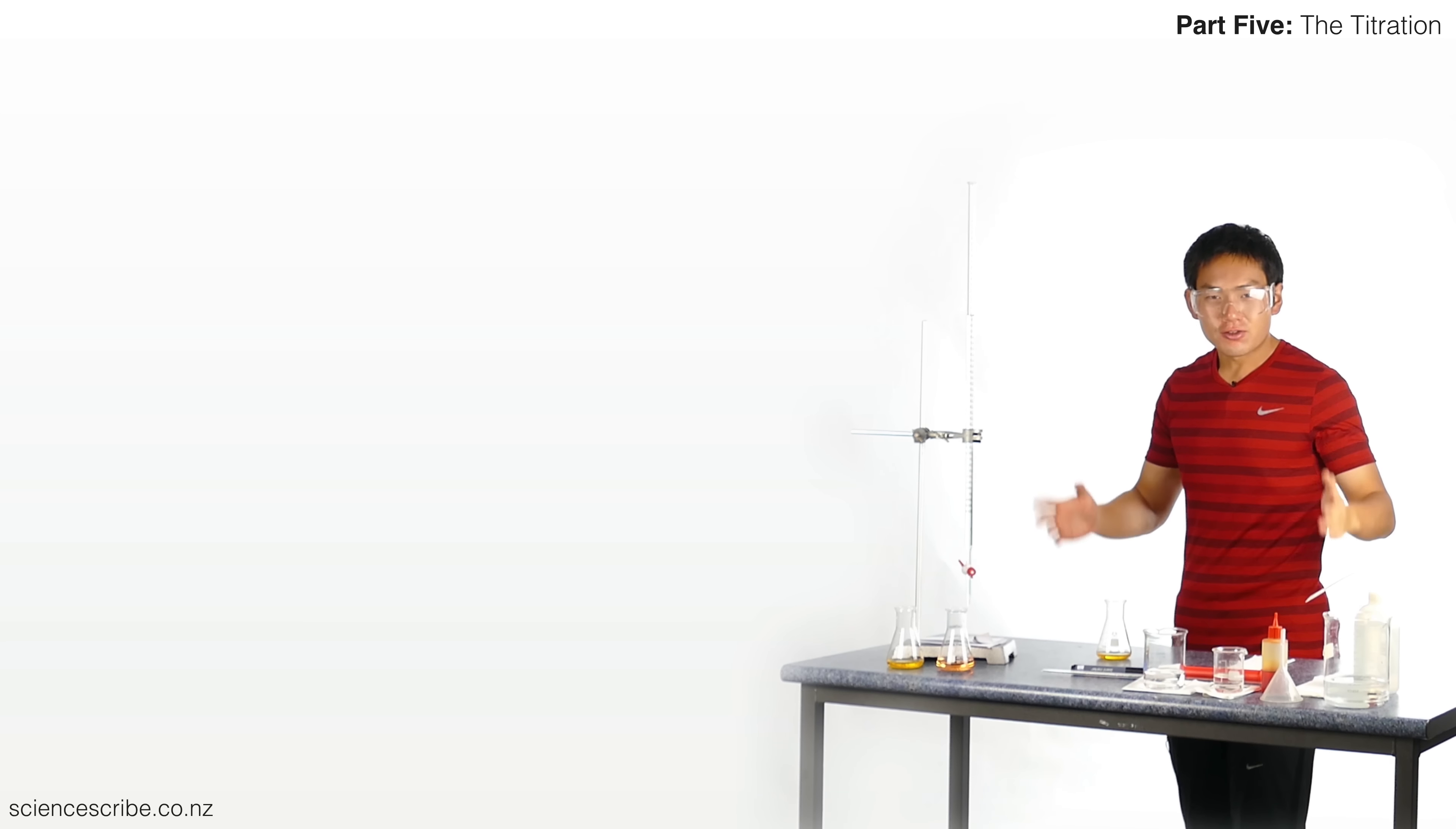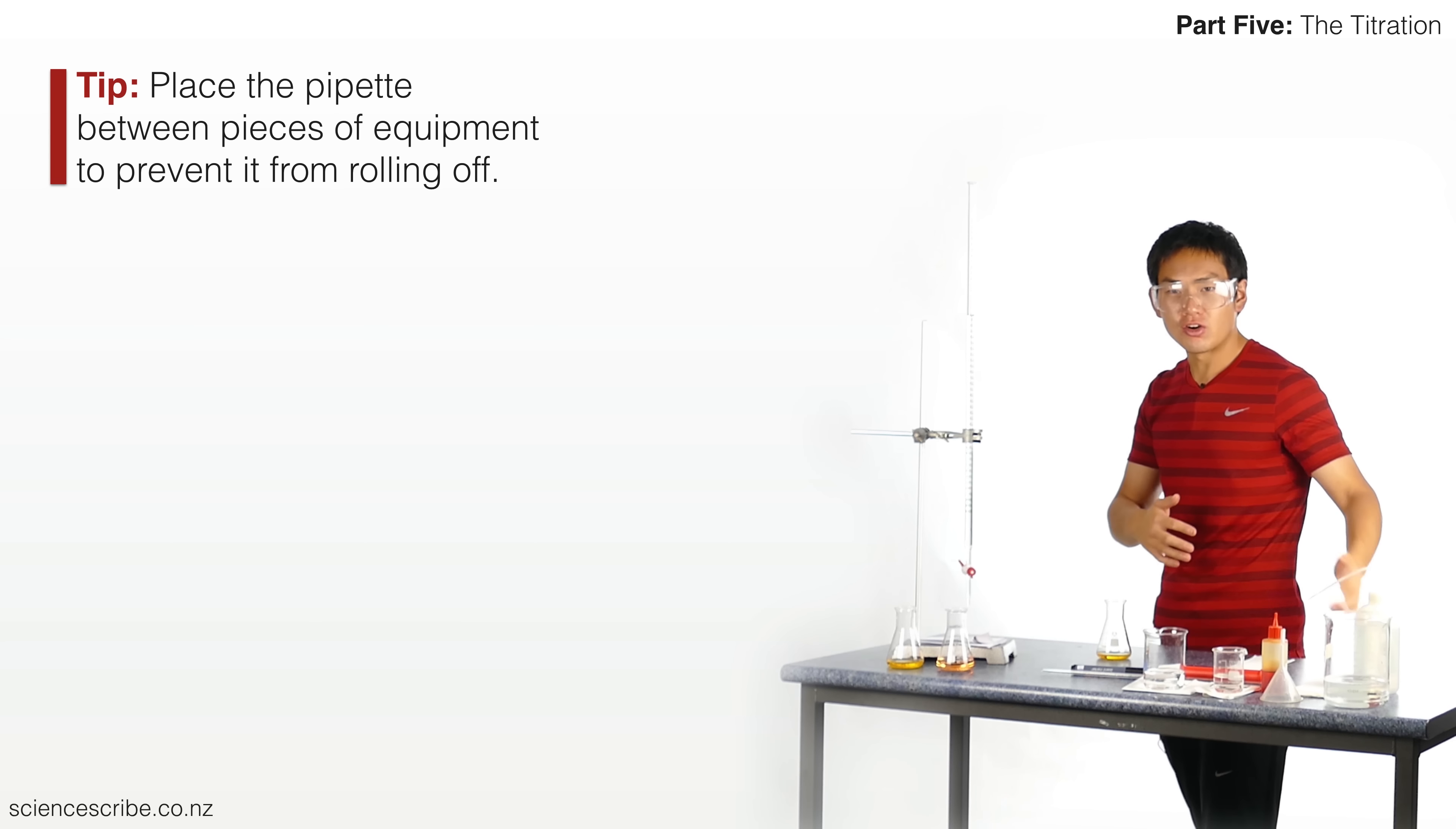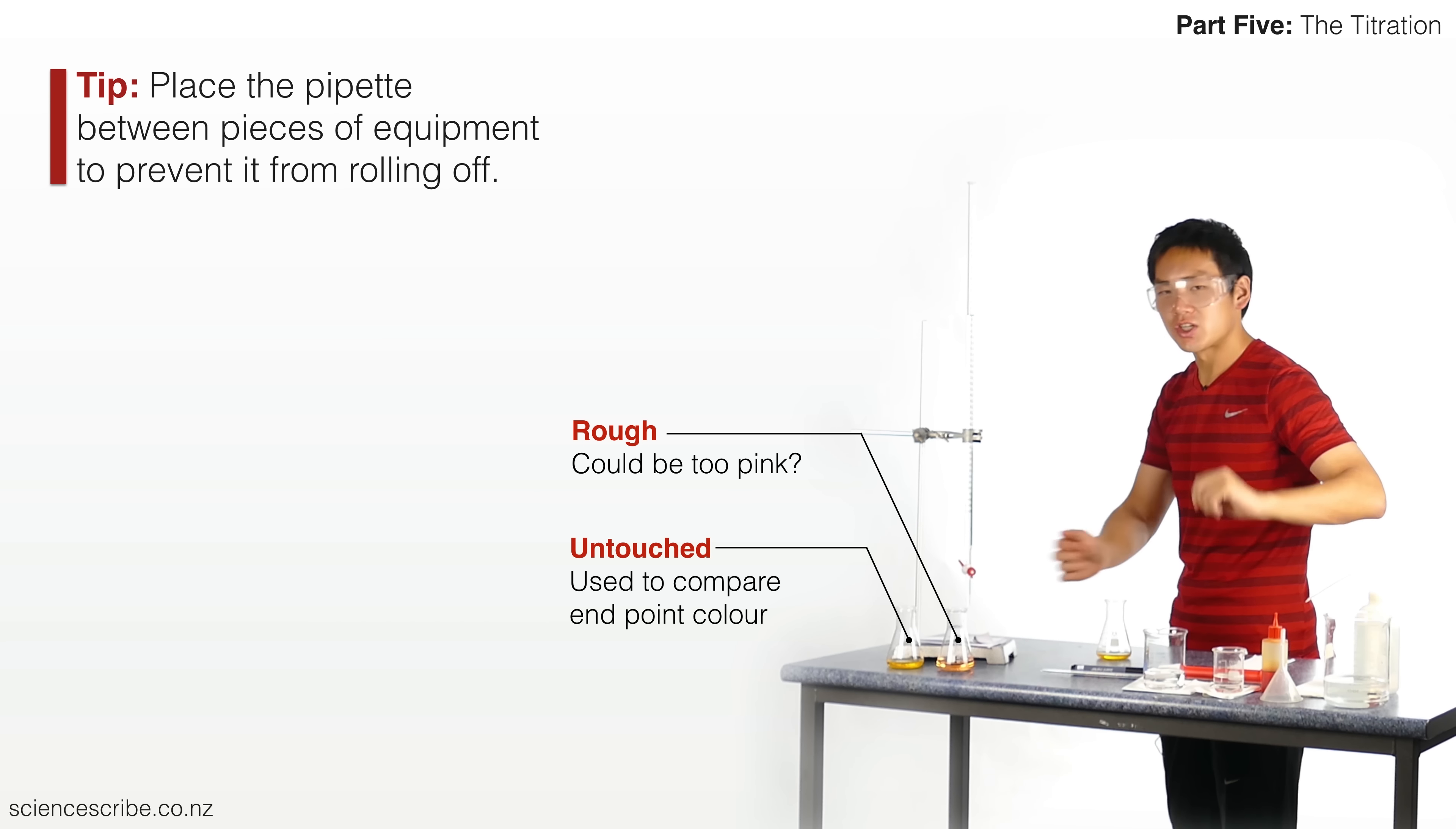We're now ready for our real titration. Before I start, I'm just going to do a quick scan of my bench to make sure that everything is safe and secure, particularly my pipette. During my titration, my attention is going to be focused around here, so I don't want to worry about the rest of my bench.